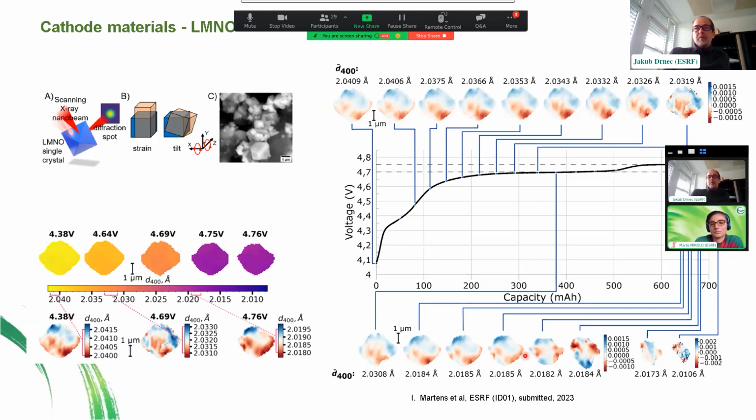Now at the bottom we suddenly see quite a change. From here to here, there is a change in the strain field. This is when we went to the first discontinuity transition, and this is where it's already detrimental.